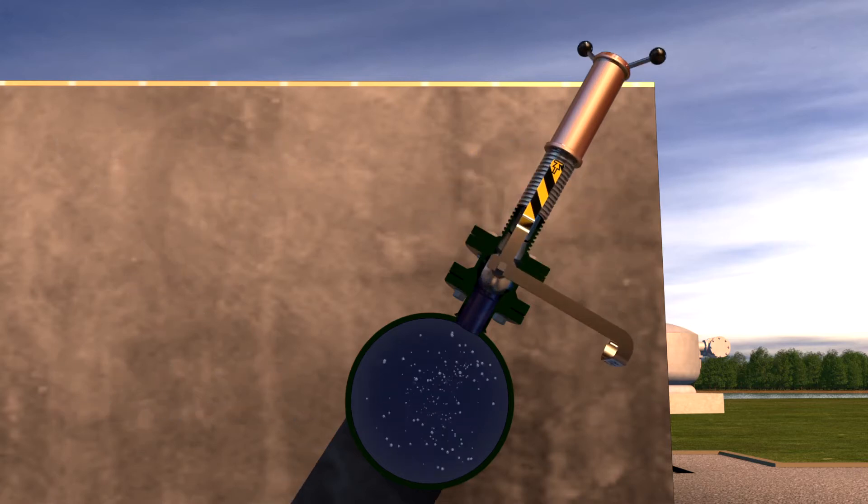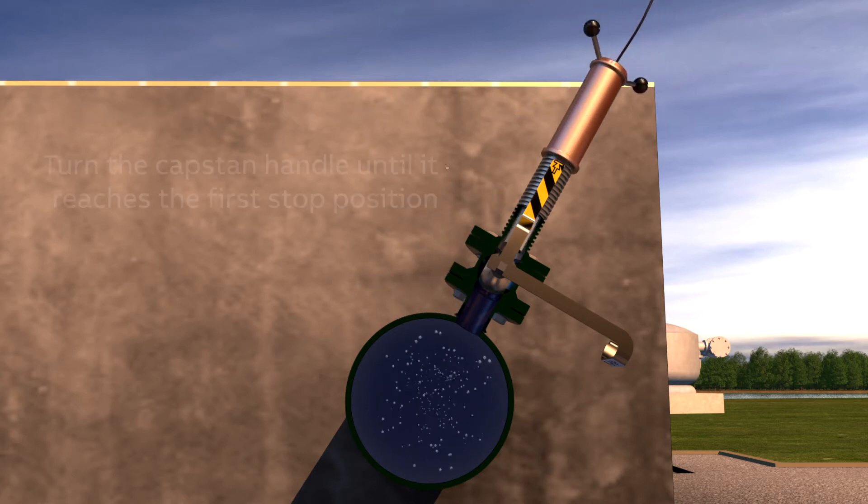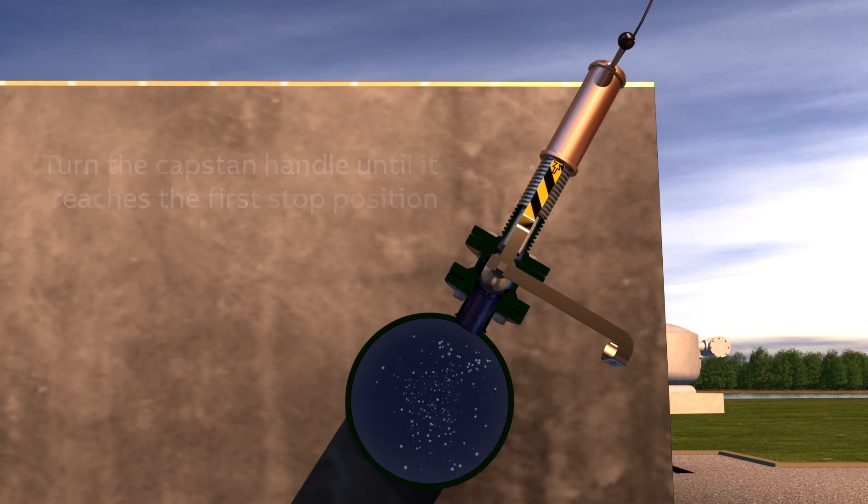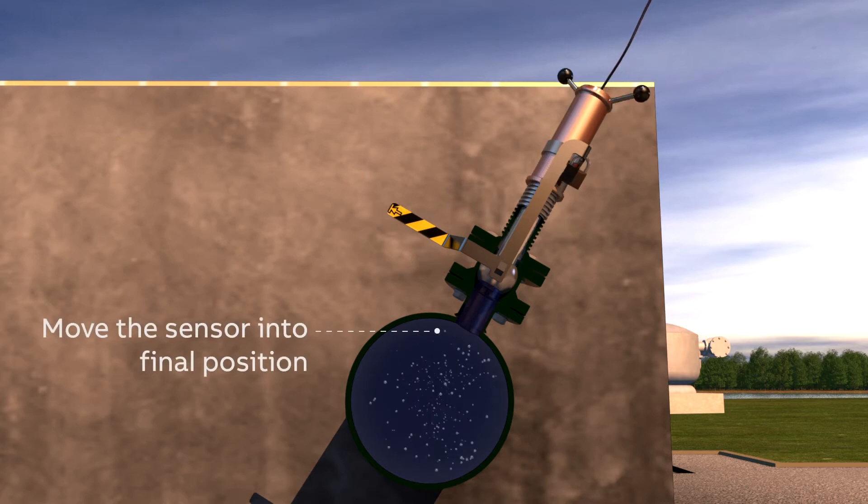Using the assembly is simple. After the sensor has been fitted into the assembly, it is inserted by turning the capstan handle until it reaches the first stop position. The ball valve can then be opened and the sensor inserted into its final position.